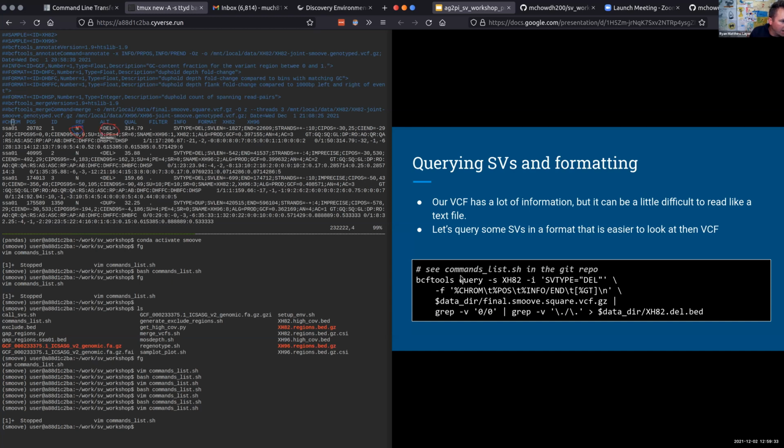For SNPs, you might expect there to be like an A here, and then the alternate allele being like a G or something. The standard for structural variation for VCFs is a little bit squishy, and you might observe different things here. We, for the sake of making the lines shorter, put an N for every reference. And then for the alternate, we just put the structural variation type. It could be a deletion. Right here, you see a duplication. There's inversions, insertions, and the general category is called BND for break end.